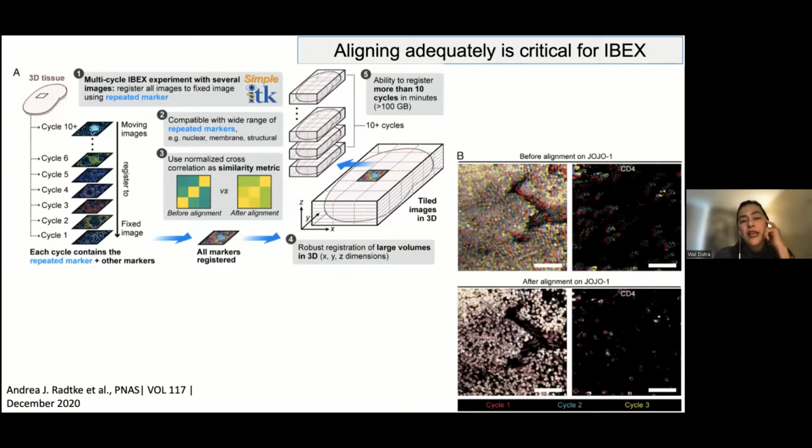Another important thing that I can tell you from our experience is, when you're reading your sample in your confocal microscope, you should look for things like this. You see this image here in the letter B. I don't know if you see my pointer. Can you see my computer pointer here? Yes, yes. Okay, great.